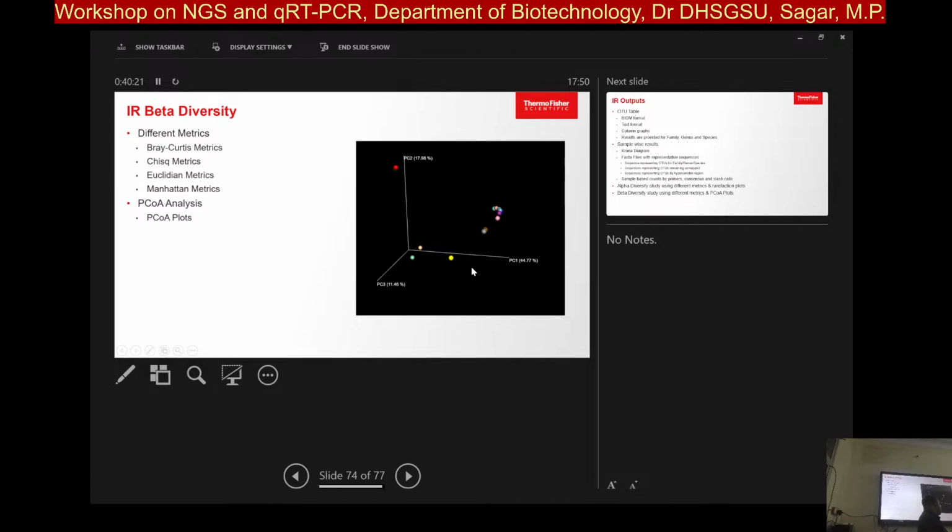People having, say, different habits, smoking habits, alcohol habits. People are more sedentary. People are non-sedentary. People are working with computers or non-computers, or people are more physically working. If they are fit, so you're trying to collect this information entirely for your 16S. So I talked about gut. It can be for your soil also. Soil could be different things that you can try to do.